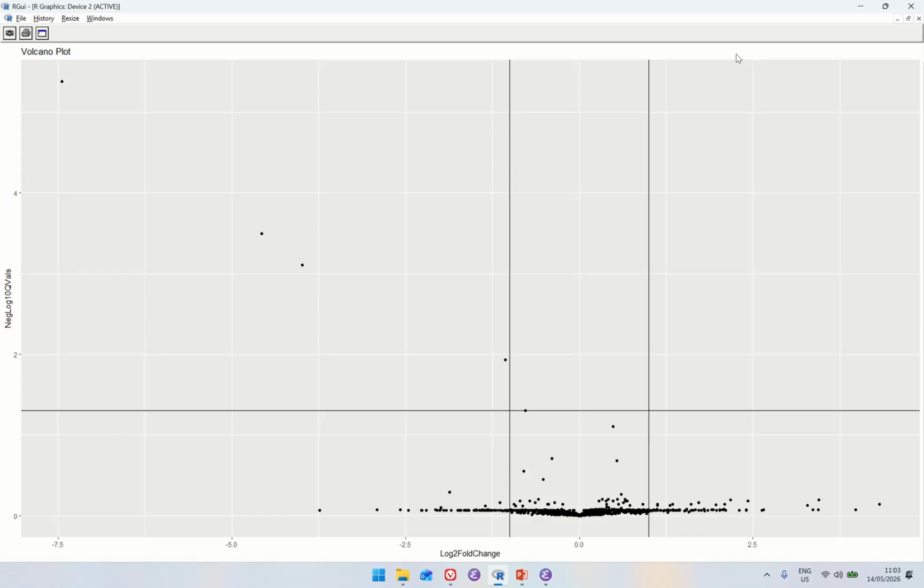Okay. So we've already talked about using ggsave to produce PNGs, PDFs, and so on. One of the questions that someone raised yesterday, I think, was, what if I have some tweaking I want to do? Maybe I want to alter the language that I use to put a title on the graph because it's going to go into a paper. And here you can see I use log 2 fold change as the name here and neg log 10 q-vals here. It's not beautifully named. So how would I go about altering that text?